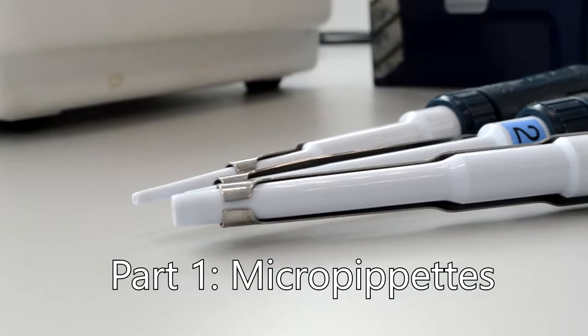And believe it or not, contrary to what most people think, a lot of the actual apparatus is quite simple to use once you get the hang of it, including things like micropipettes, which look really complicated, but they get really easy to use really fast.